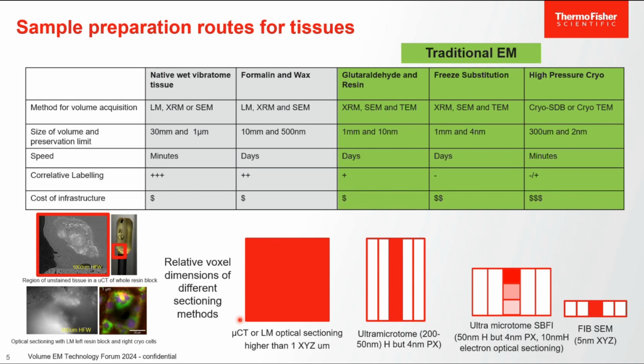When you look at the traditional EM work, I just want to give some idea about the comparative pixels, if you like, that you get from the technique.